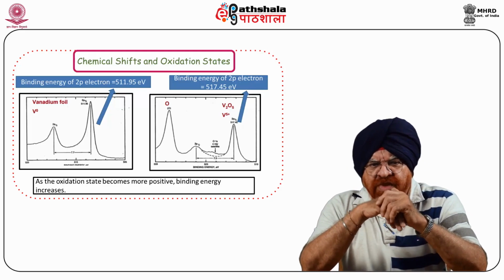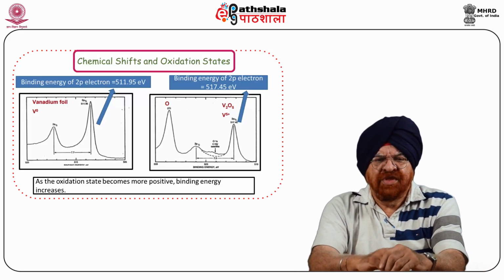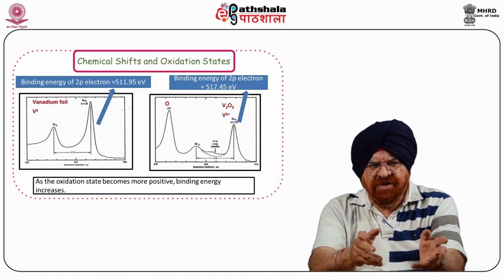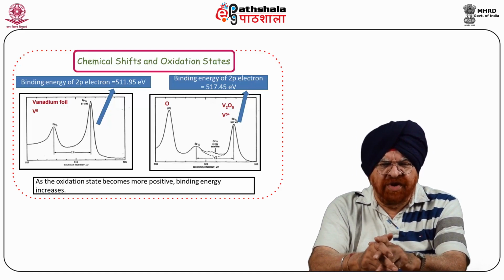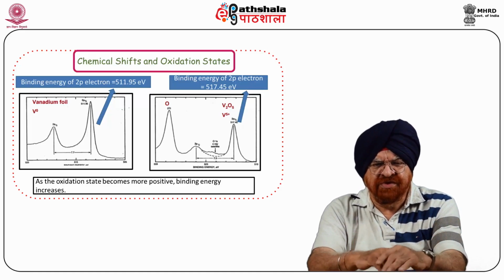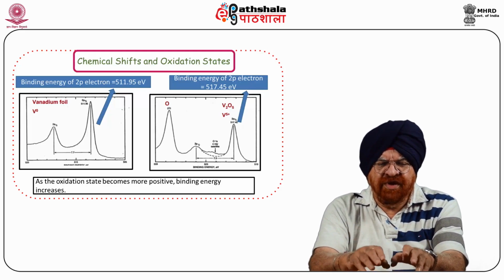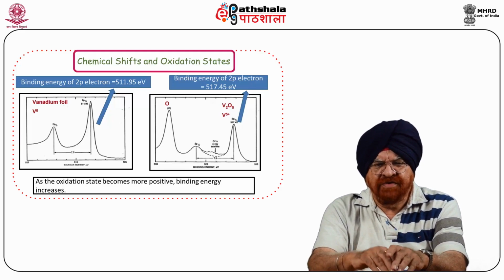volumes. The area under a peak in the spectrum is directly related to the amount of the element represented by that peak. This is a very simple way of finding out how much of an element is present on the surface of a particular species. The peak shape and the precise position indicate the chemical state for that particular element.